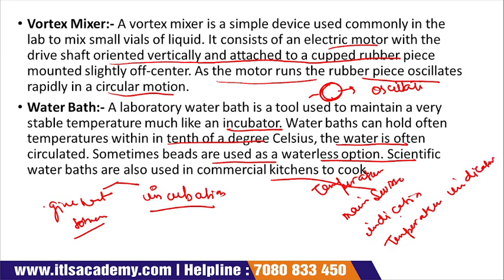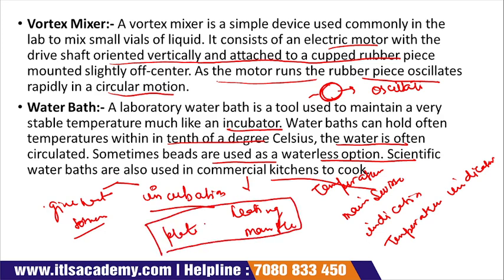And one more thing, there is a heating mantle and plate present in the water bath. So before filling the water, we have to take care about these two things. The heating mantle should be dipped into the water.